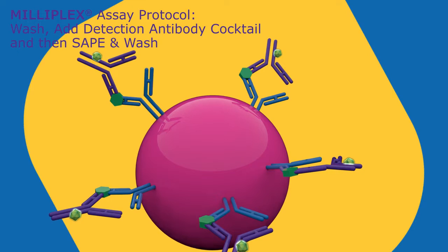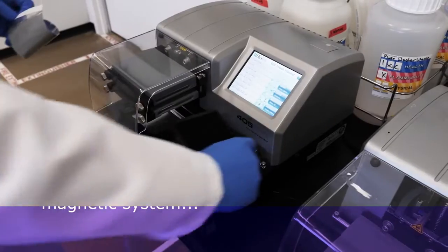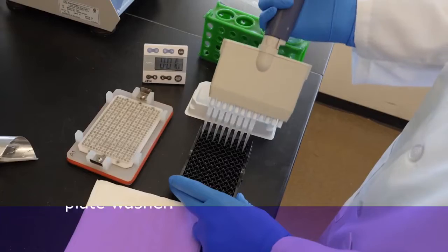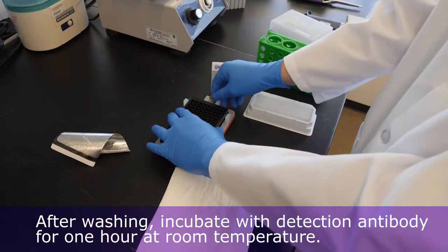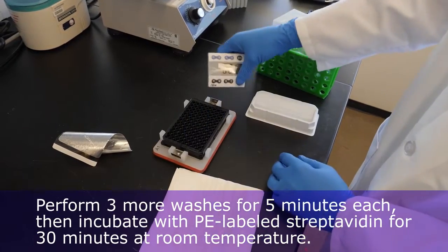Now let's see how our scientists do it in the lab. Perform three washes for five minutes each. Washes may be performed on an automated magnetic system such as the BioTek plate washer shown here, or manually with a handheld magnetic plate washer. After washing, incubate with detection antibody for one hour at room temperature.